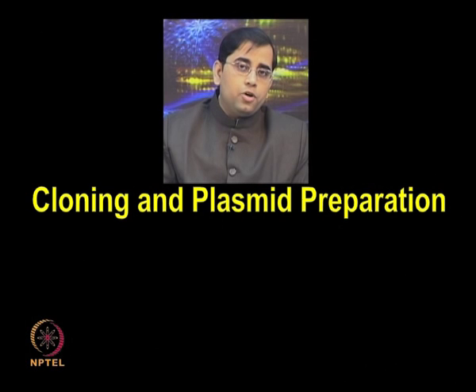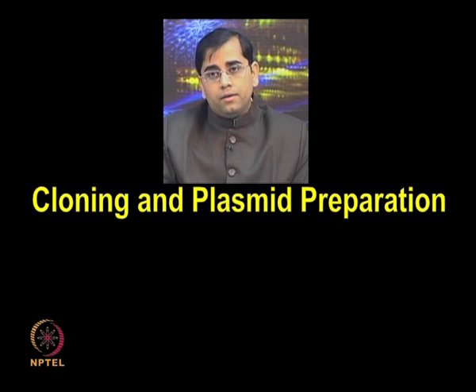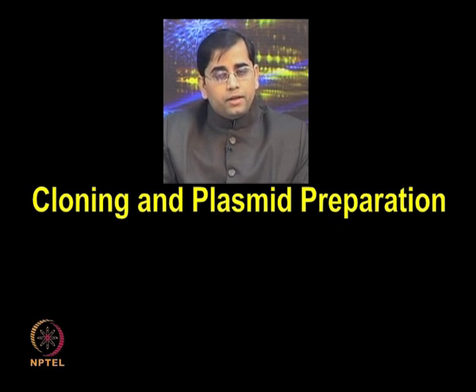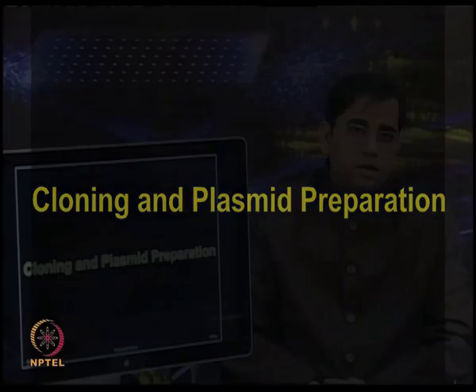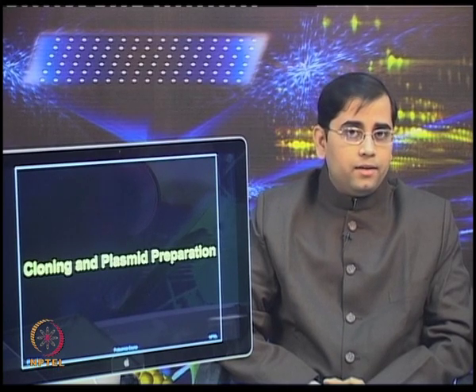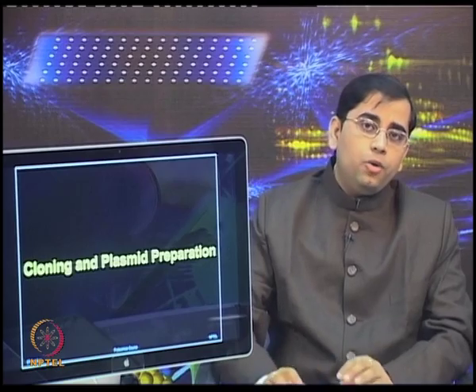In the last lecture, we talked about recombinational cloning. So, researchers have started to create such collections of cDNAs by using recombinational cloning, which allows for the rapid transfer of DNA fragments from one vector to another in frame and without any mutation.